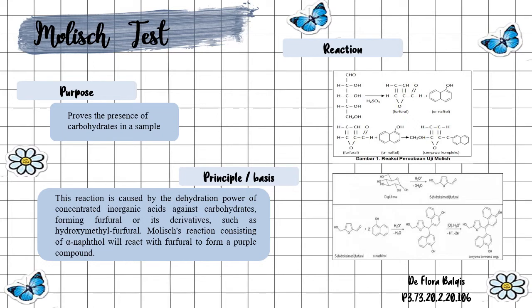And then this is the reaction of the Molisch test. This is the sample for the Molisch test. First, there are maltose solution, aqueous solution, fructose solution, glucose solution, sucrose solution, lactose solution, amylum solution, galactose solution.